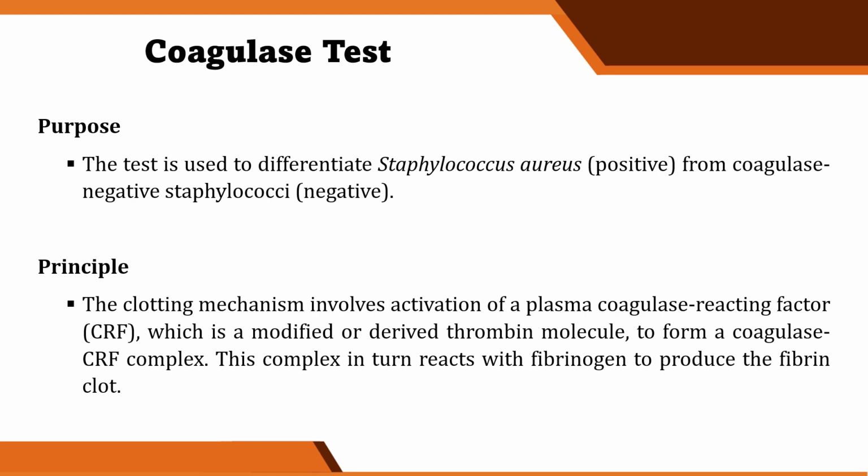Coagulase is an enzyme na present kay Staphylococcus aureus that enables them to clot blood plasma, similar to the mechanism ng normal clotting natin.